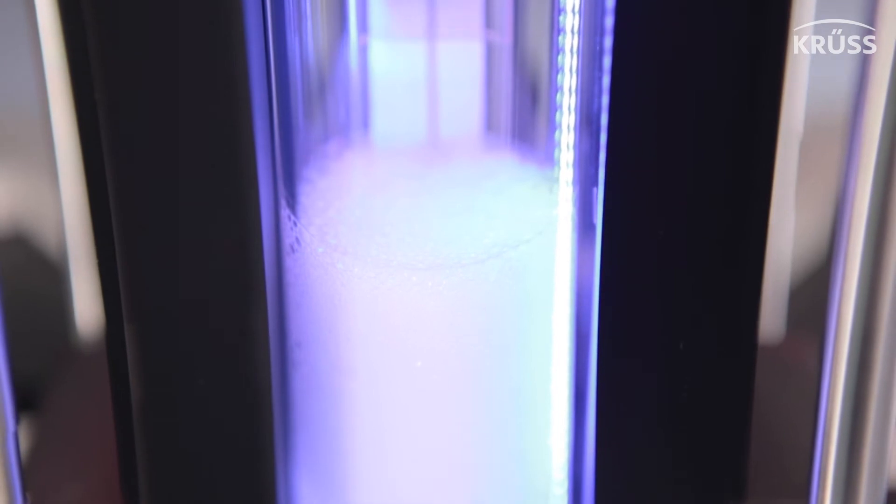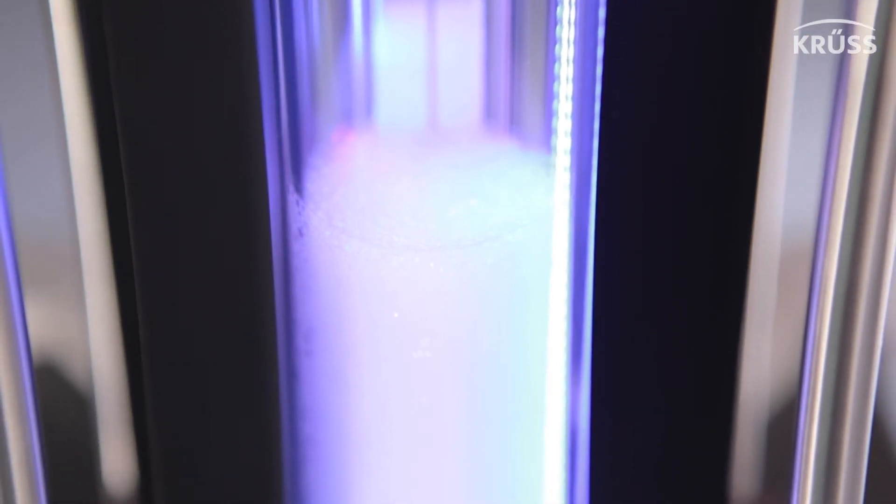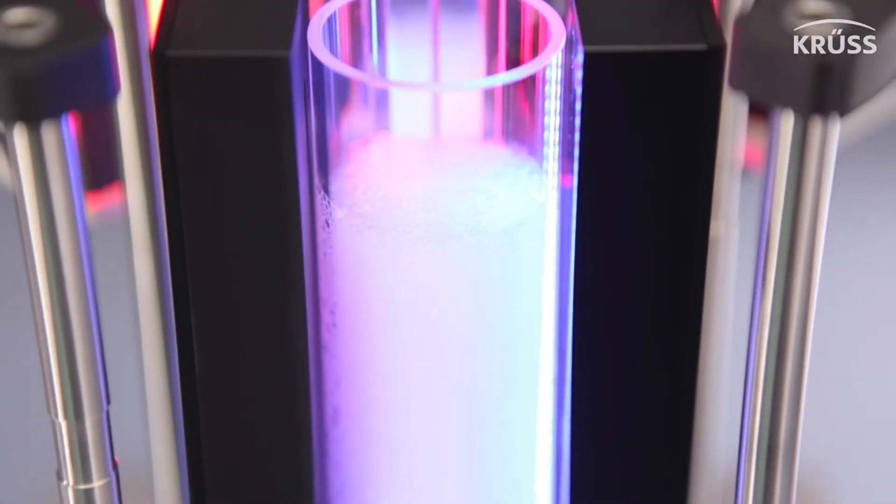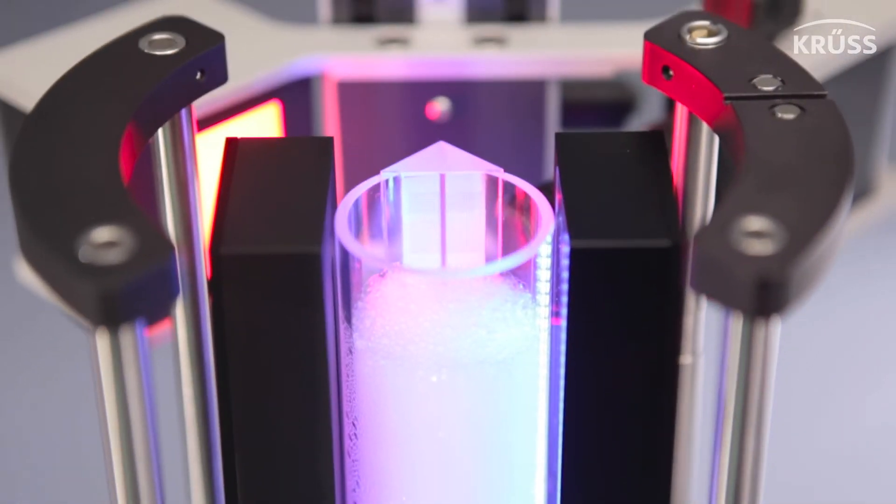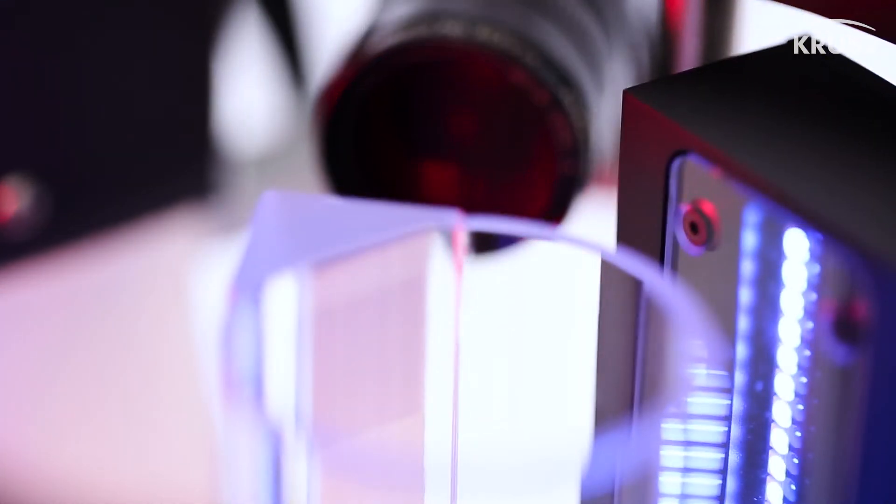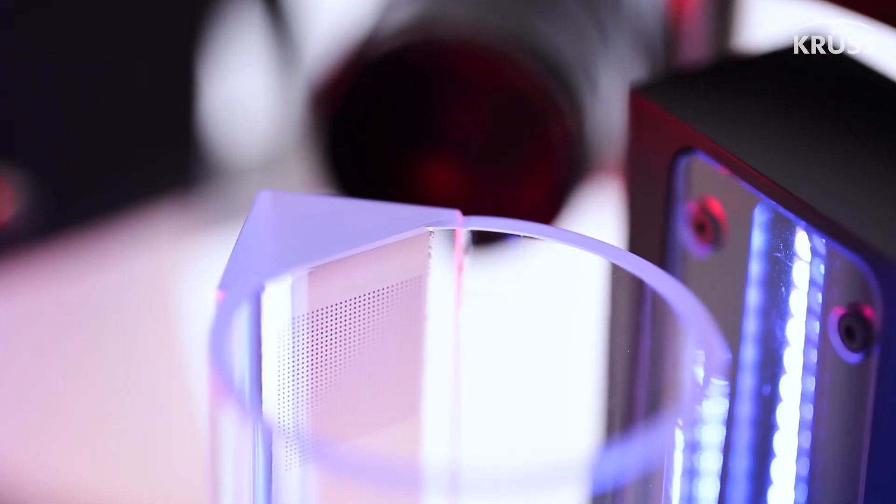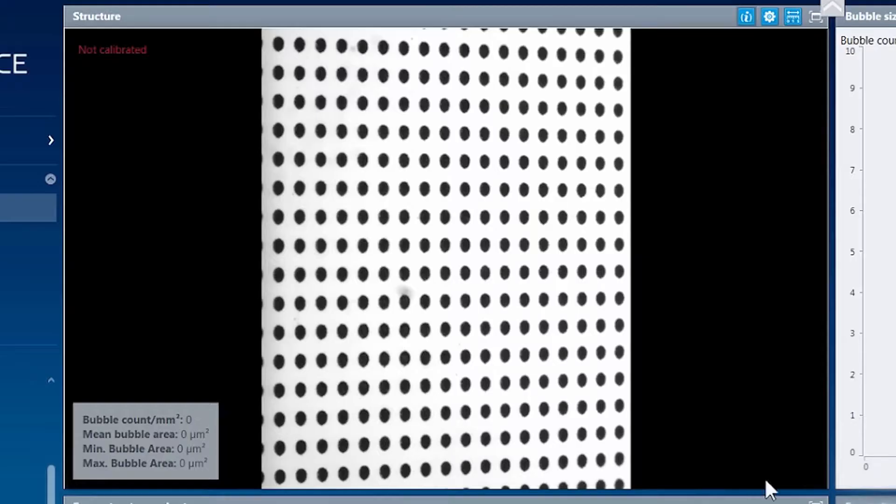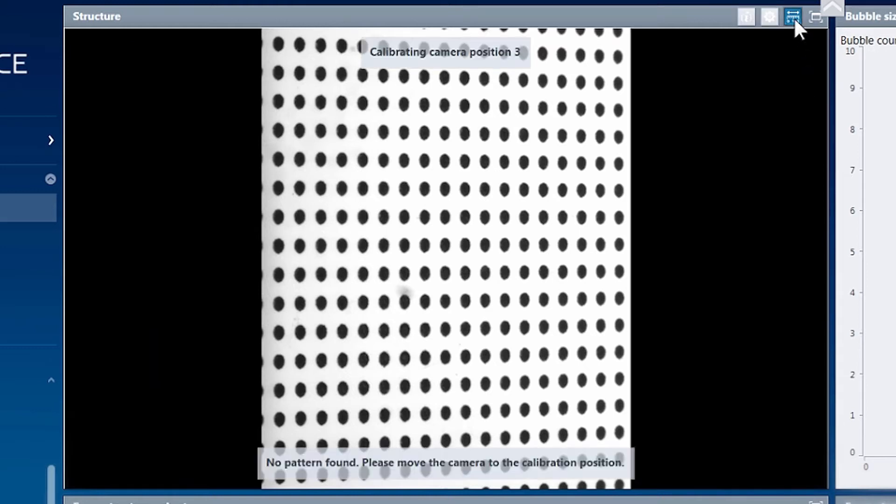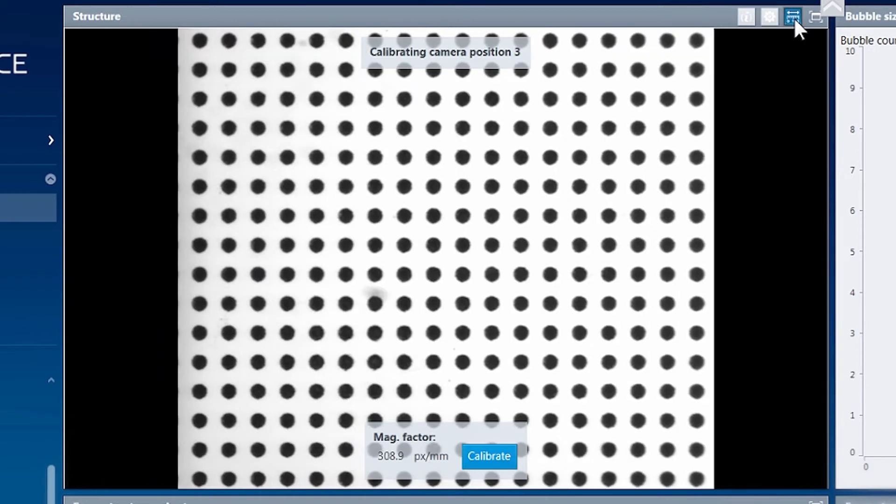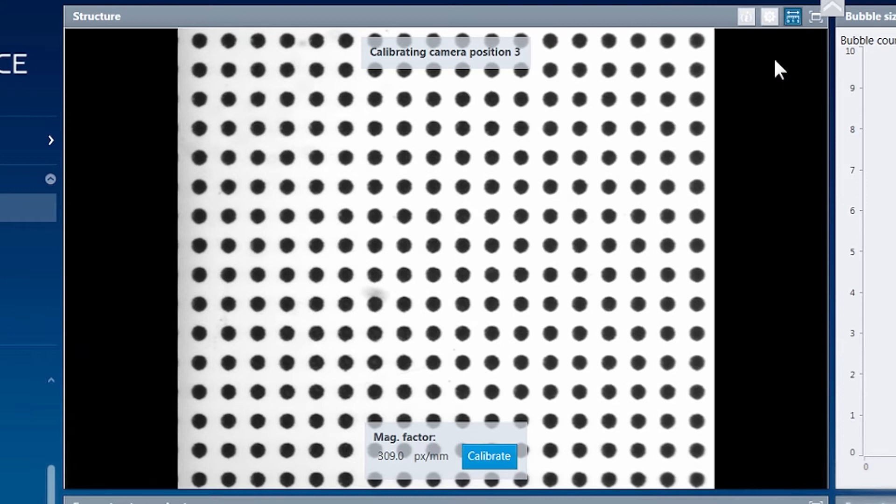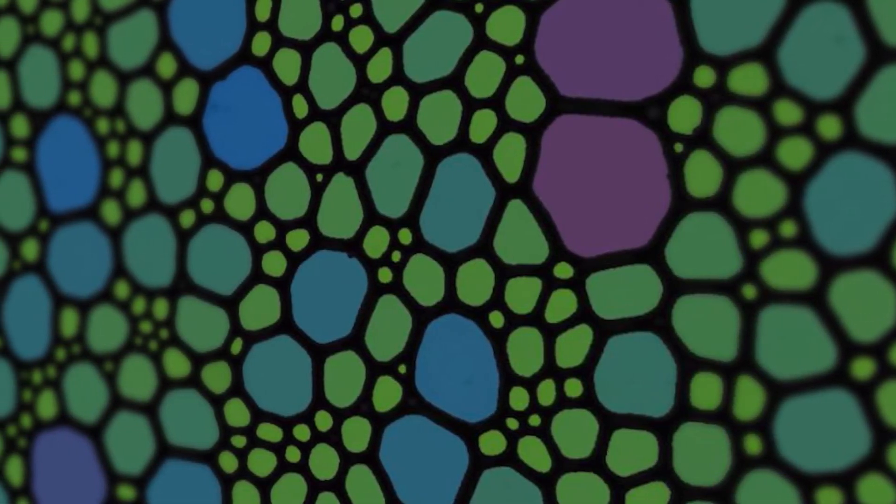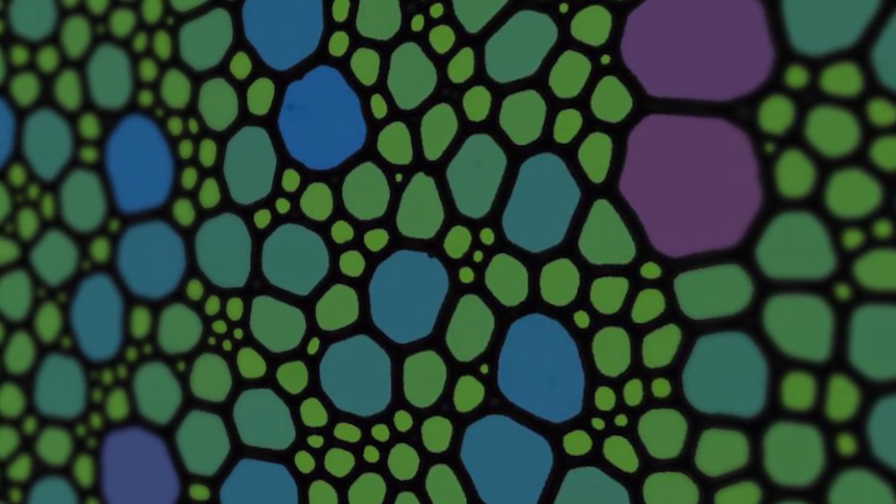To aid in foam structure analysis, our software was designed to work in perfect harmony with our instruments by using the calibration grid, which is lasered onto every prism column of our foam analysis instrument line to precisely calibrate the measurements. This eliminates image distortion and allows highly accurate measurement of the individual foam bubble sizes in absolute values.